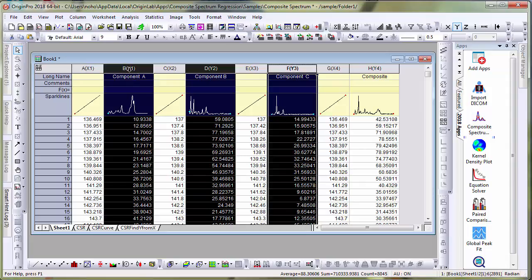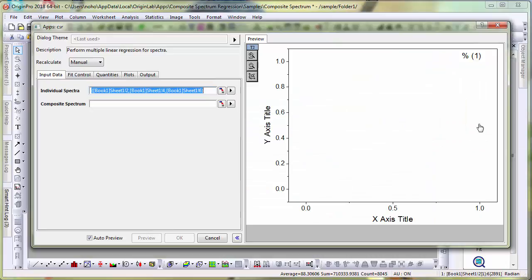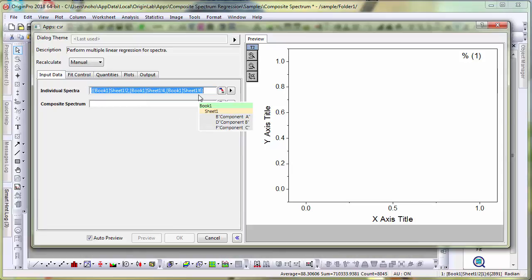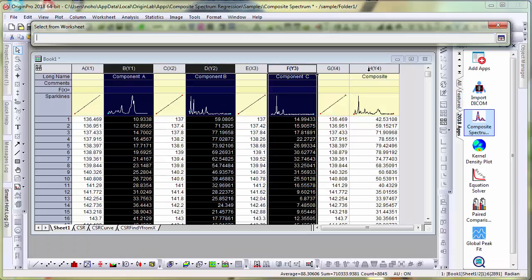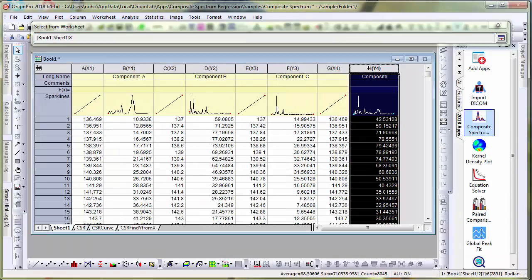I have already selected my components. Let me click the app icon to bring up the dialog. The individual spectra have already been loaded based on my selection, and then I can choose the last column which is my composite.